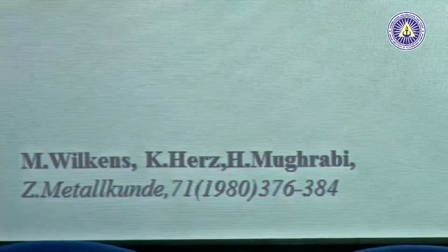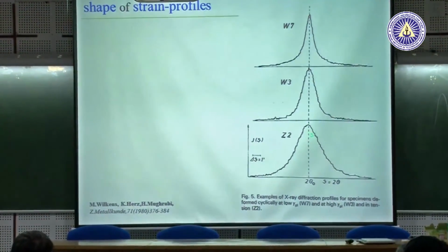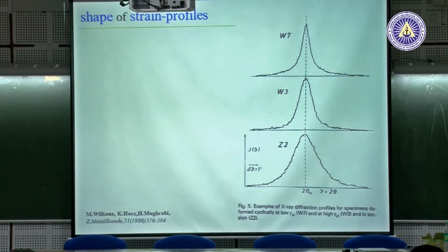The upper one has long tails. The center one has short tails, and the lower one also has short tails. Unfortunately, I could not put them onto each other because I can only copy them as an image, and then they cannot be transparent. Otherwise, it would be nice to put them together.